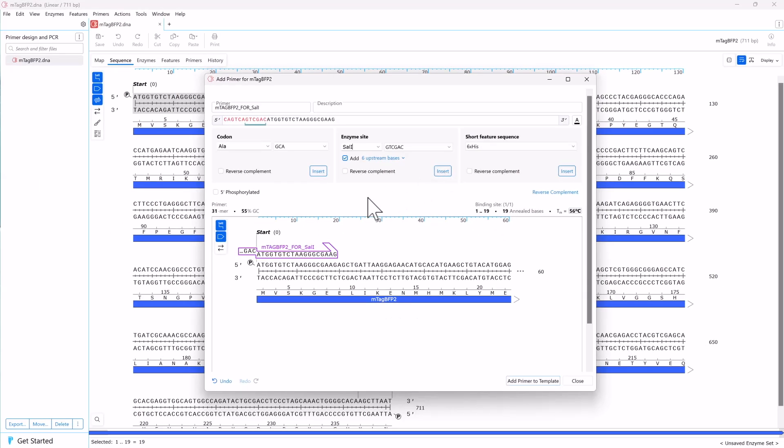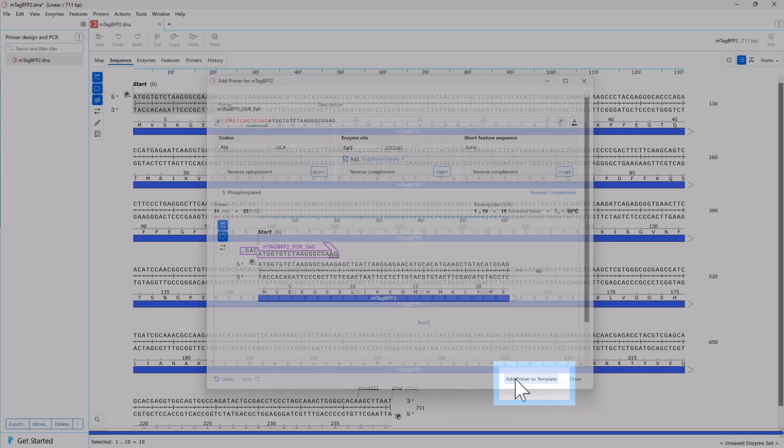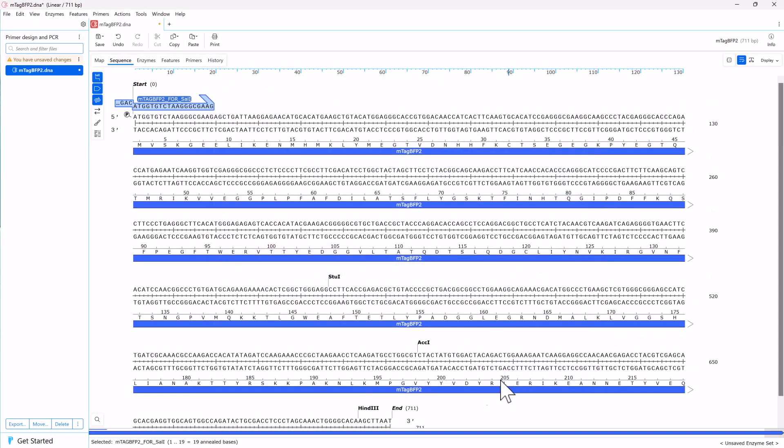The new extension will be red and a green bar will mark the Sal1 site. You can hover to see the site name. Now click Add Primer to Template to add the new primer to your sequence.